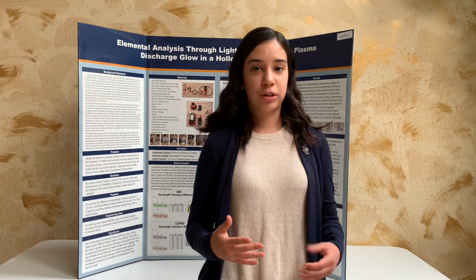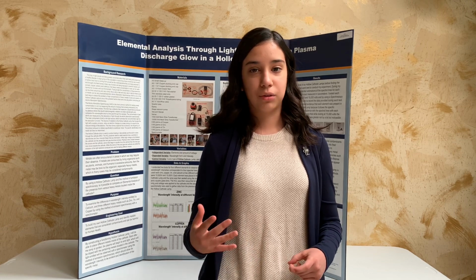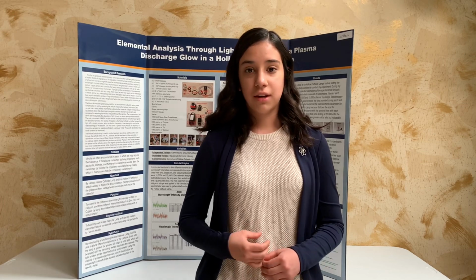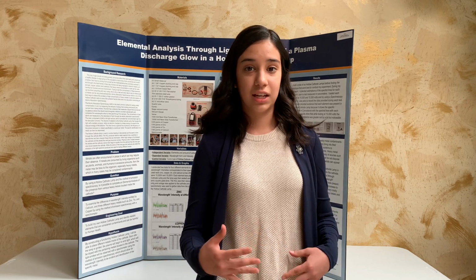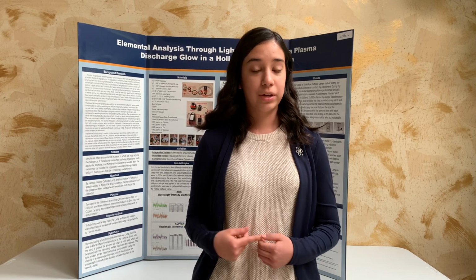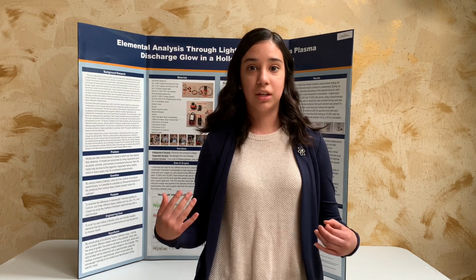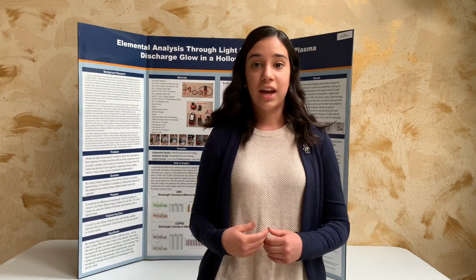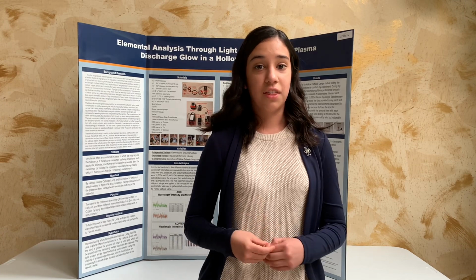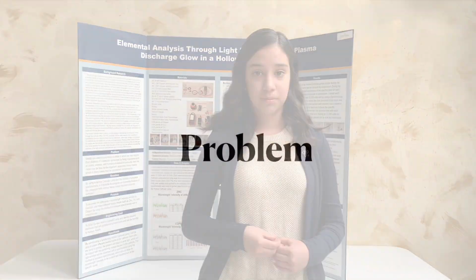So both of these forms of spectroscopy require the use of a hollow cathode lamp. The hollow cathode lamp is where the metal or the particular soil is placed inside of, and eventually it may be diluted inside of the hollow cathode lamp in order to be able to detect what type of metal is contaminating these various materials. Not only can metals be contaminating soils, but they can also be contaminating plastics, which can be the source for children's toys. And as we know, children sometimes may end up putting these toys inside of their mouths, and eventually they'll also be exposed to these heavy metals, which can be harmful to them and to our environment.